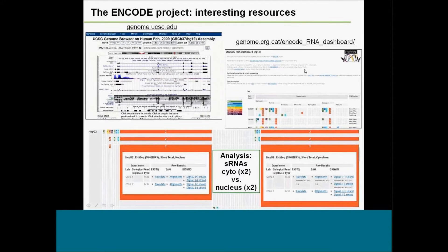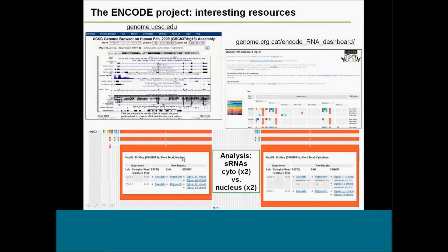From the RNA-seq dashboard you can browse different RNA-seq data files and choose what you want to investigate. In this case, we went to the HEPG2 cell line as an example and looked at short RNAs extracted from the nucleus on one hand and from the cytoplasm on the other. We have two files for each condition — biological replicates — giving us more statistical power in the analysis.